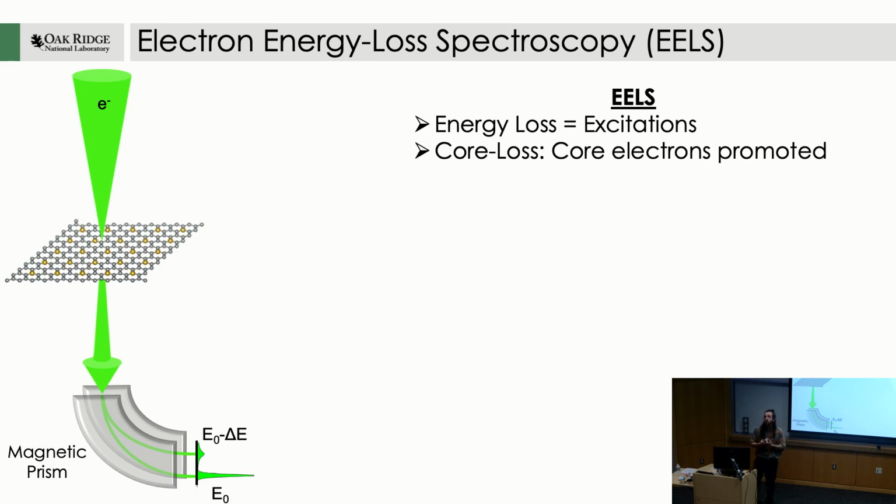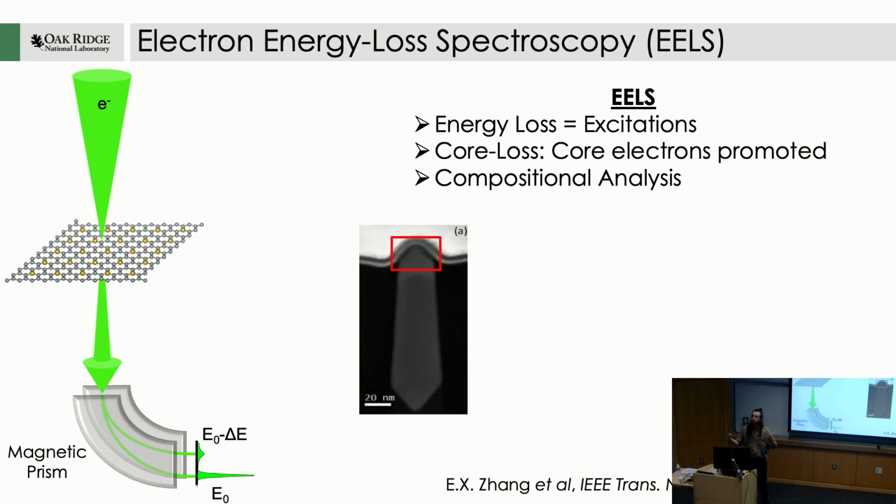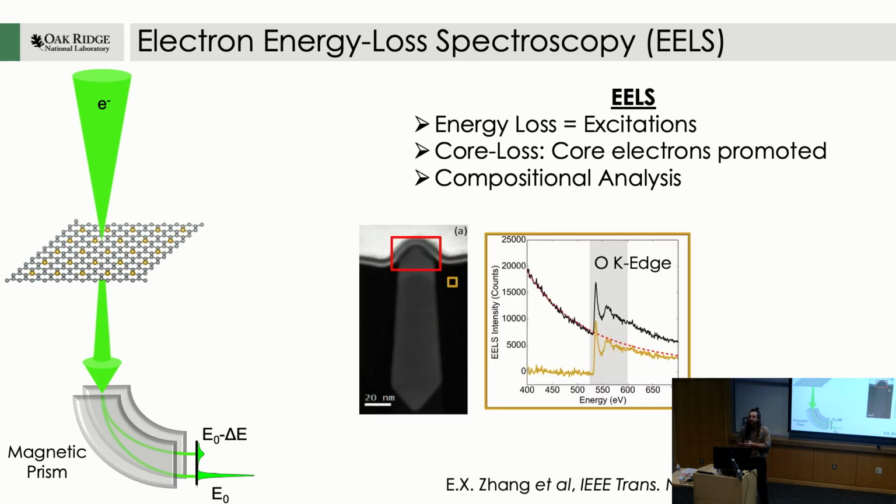The most conventional one is called core loss EELS. In this, what you primarily use it for is compositional analysis. The reason is that the core shell electrons in any individual atom have very specific energies away from their valence band. So essentially, you can do something like go to a transistor gate stack, and you can go to 532 electron volts in your EEL spectrum. And 532 electron volts is the oxygen K edge. So when you see this sharp onset of intensity in your EEL signal at 532 electron volts, that uniformly corresponds to the presence of oxygen in your sample.